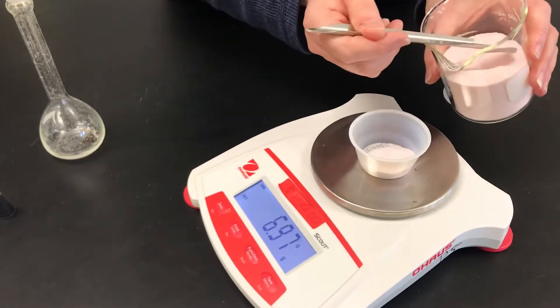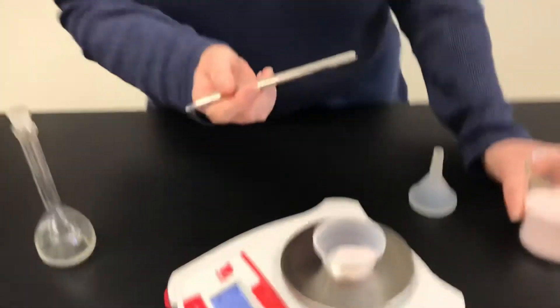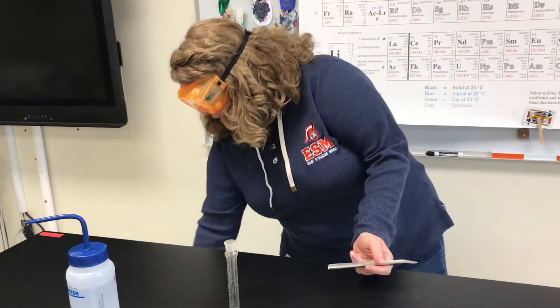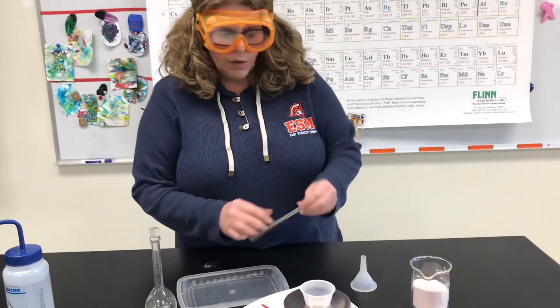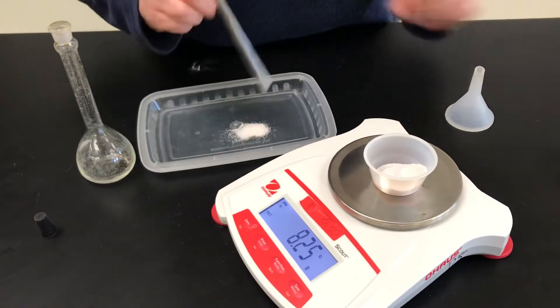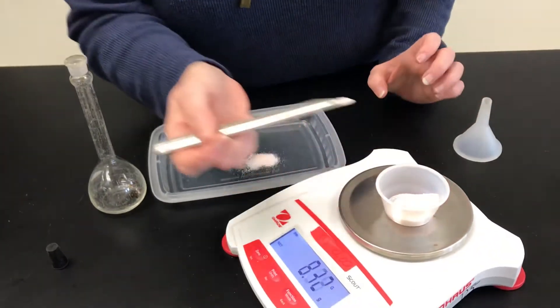Now what happens if you take too much? Can I put it back in the beaker? No. If you take too much, like I did, I'm going to have to put that somewhere else. I can't put it back in here because then it's going to contaminate my whole supply of Kool-Aid. So I'm just going to discard that extra 0.93. Maybe I'll switch to the finer end of my spatula to get smaller amounts each time.